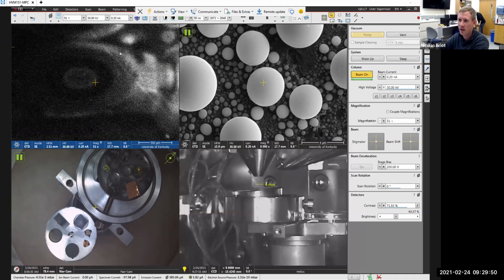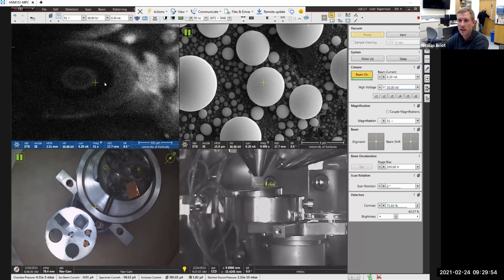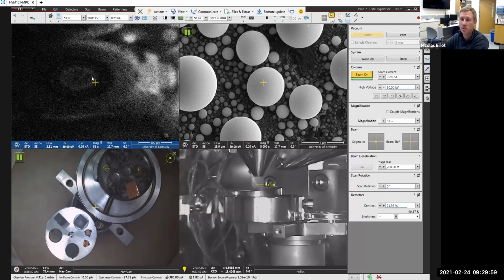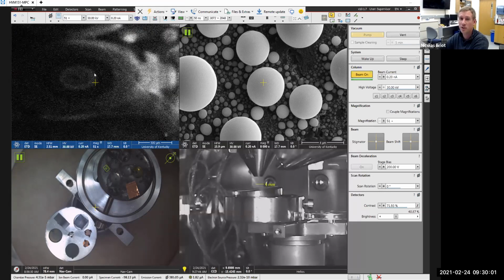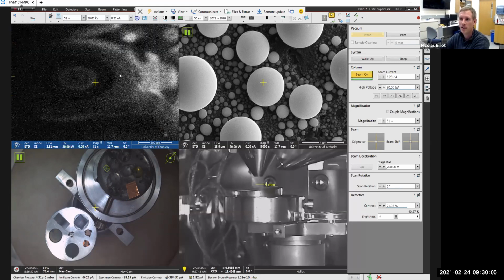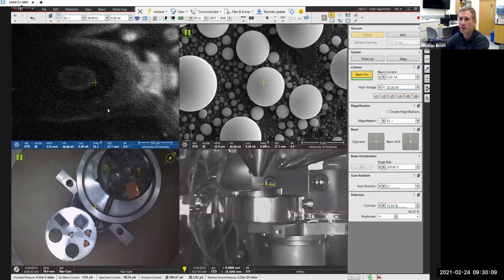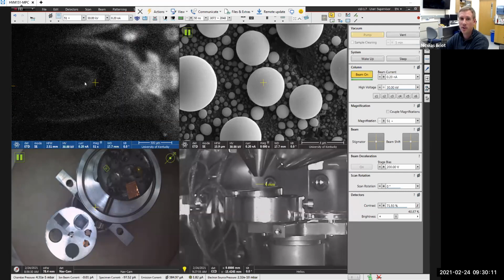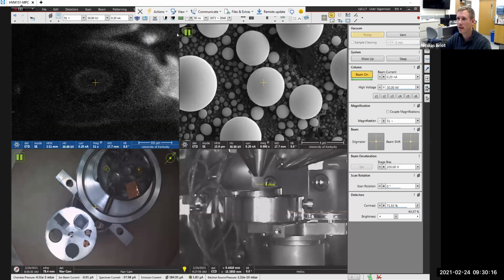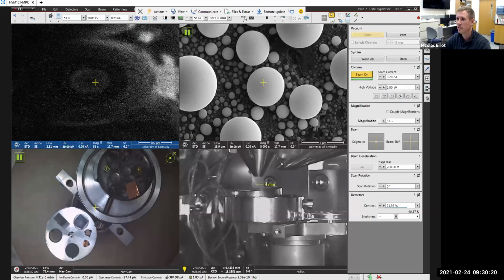What's happening is that right now, because this material is not electrically conductive, I'm sending a lot of electrons into the sample, but the sample has no way to get rid of them. Okay, so they accumulate into the material, and right now they stay there. So the surface of the sample becomes negatively charged, and it's turning effectively into a mirror. And let me reduce the voltage, and I'll try to make a nice mirror.